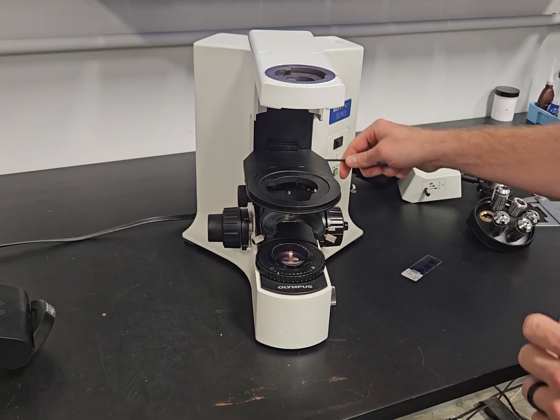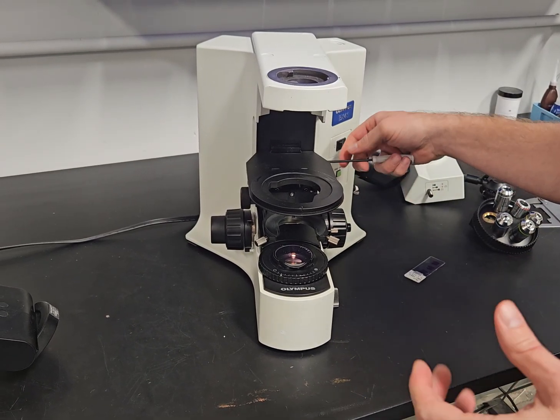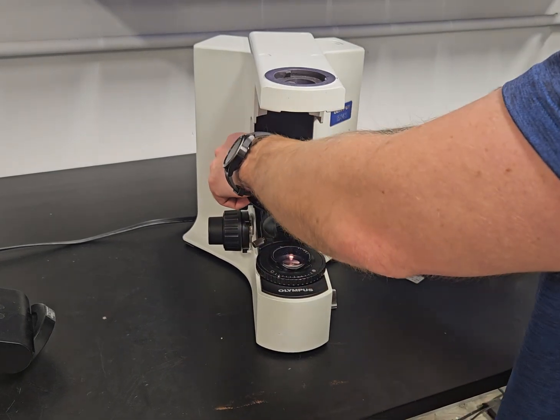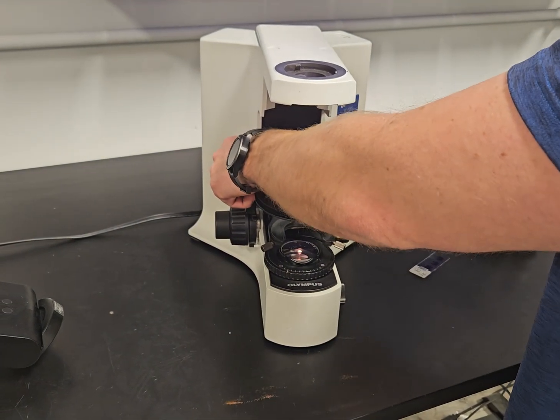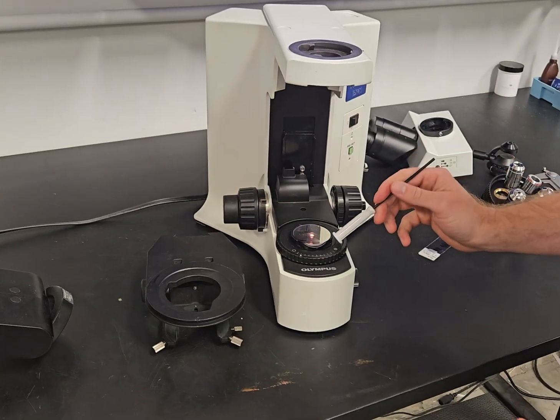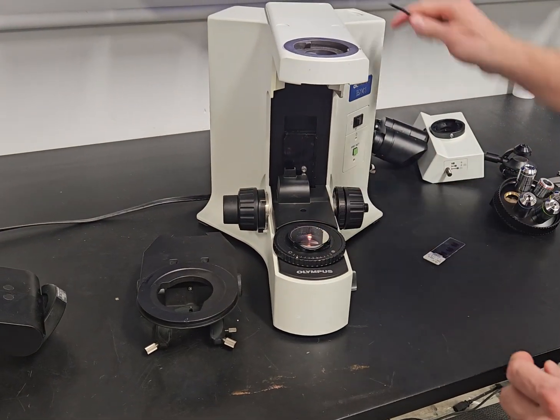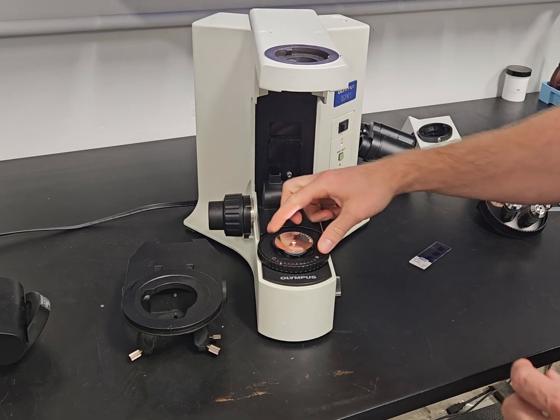If you don't have that, you'll get a vignetting or a shadow around the edge of the 2X. This is your sub-stage condenser bracket. When you have this off, you have a daylight blue filter on here, a didinium filter because this scope's halogen.